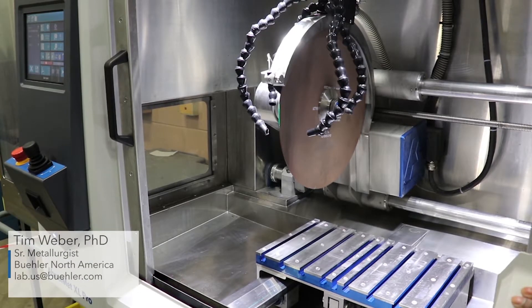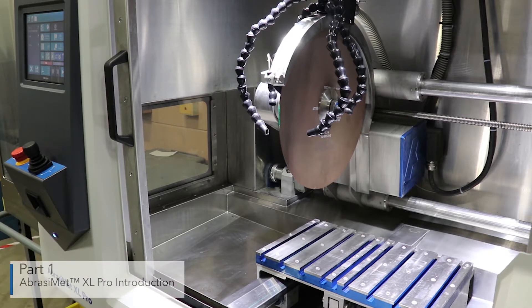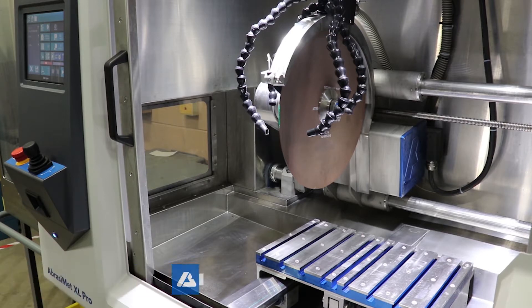Today we're going to talk about the Buehler AbrasiMet XL Pro heavy-duty abrasive cutter. This is a large abrasive cutter designed for high-volume applications. A few of the design features to talk about here: a 13 horsepower motor, blade sizes ranging from 14 to 18 inch size, and a very easy-to-use interface for control of the machine.